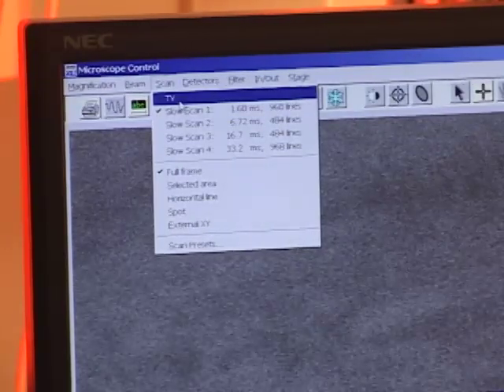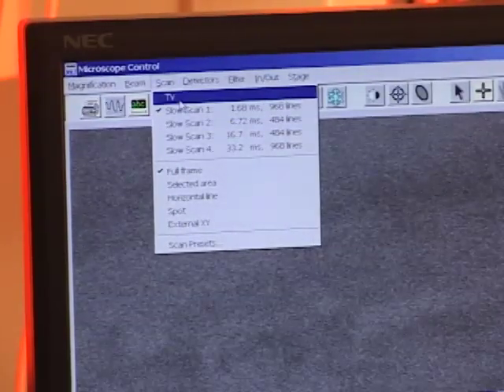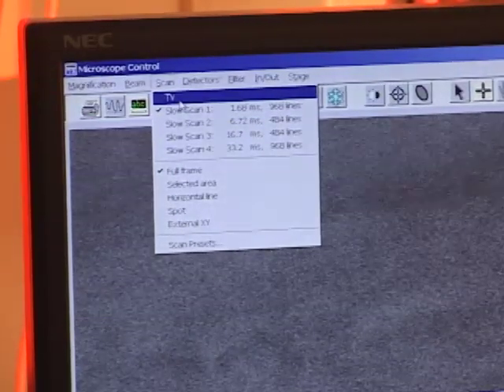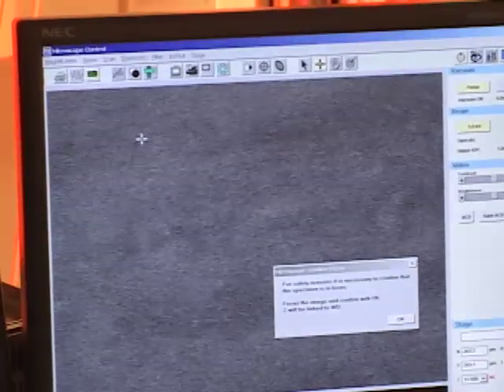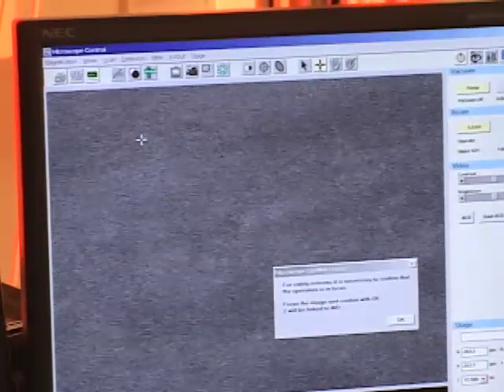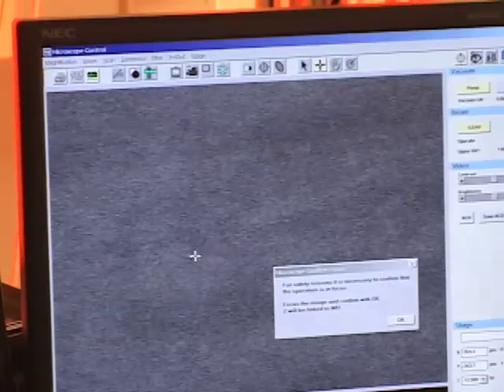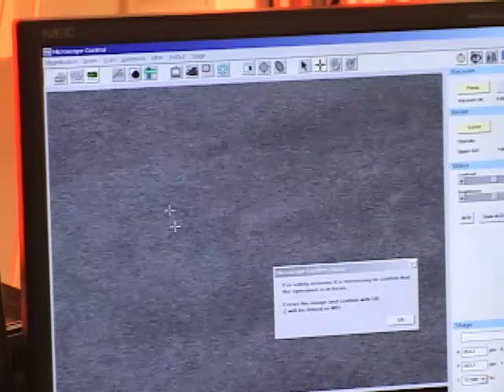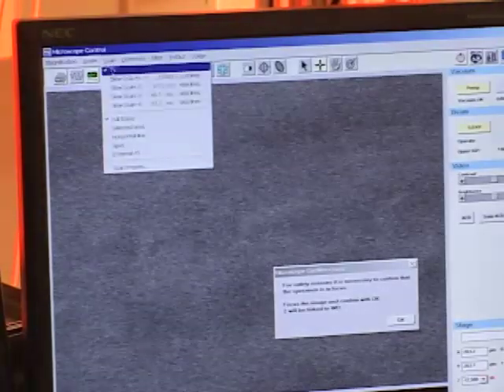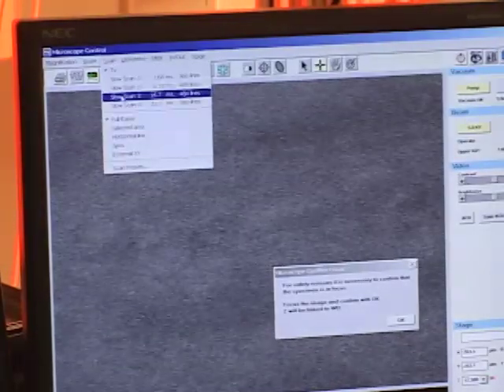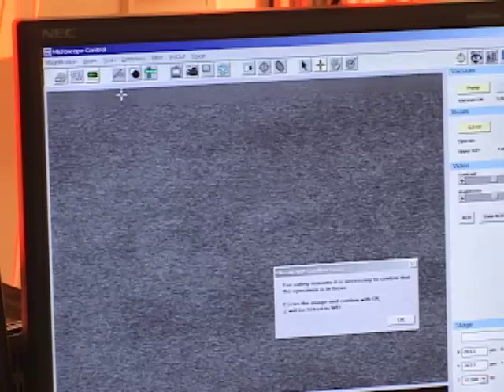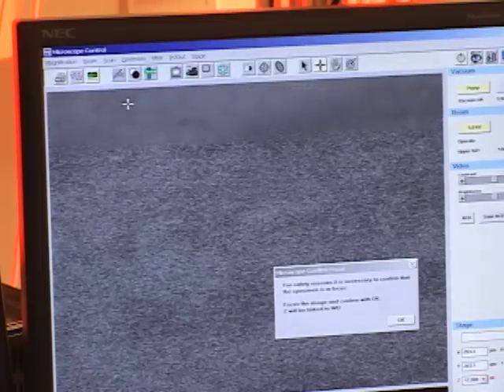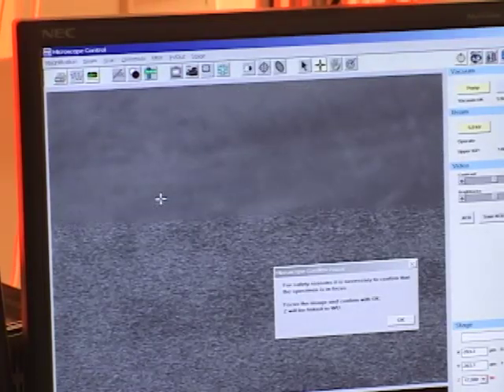If you watch the change in the screen as I go from slow scan 1 to TV, you'll notice that the resolution gets a lot worse. TV mode is good because it updates the screen quickly, but it has a very low signal to noise ratio and so we see a lot more static in this image.